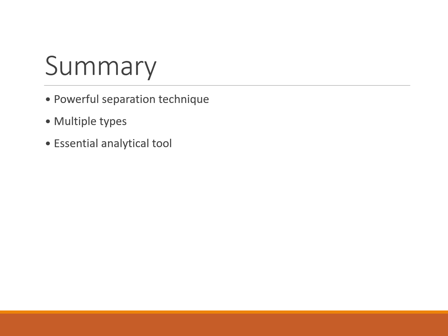So to summarize, chromatography is an essential analytical technique. It works on the principle of different movement of components. Different types of chromatography are used for different analytical purposes.